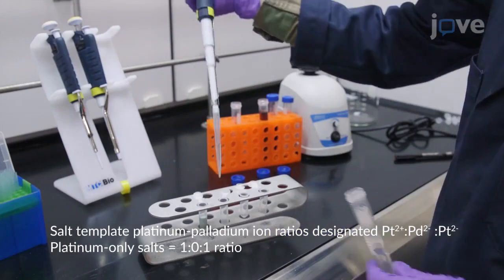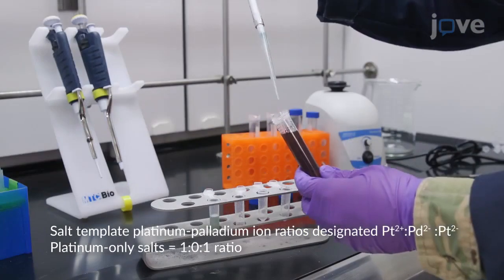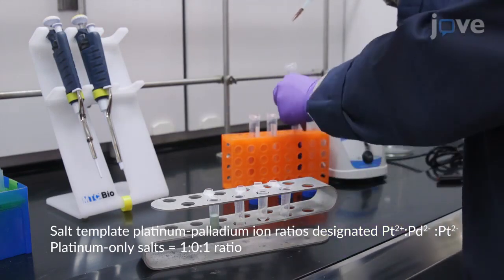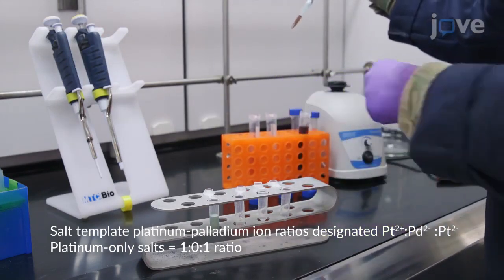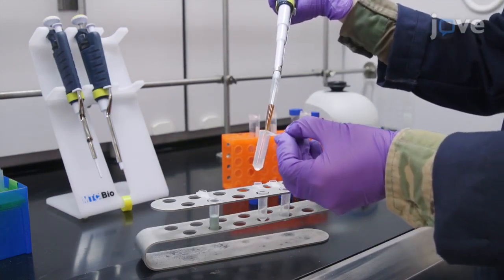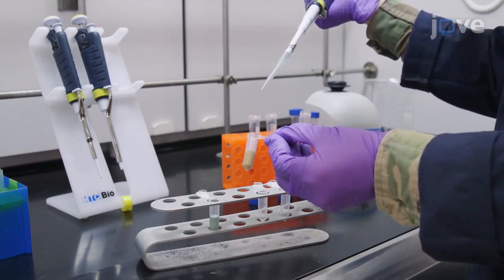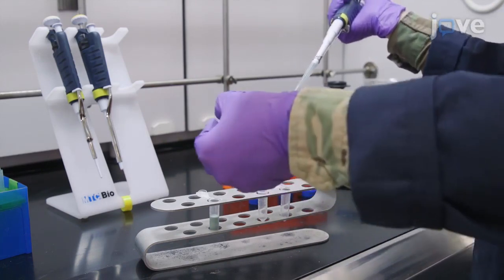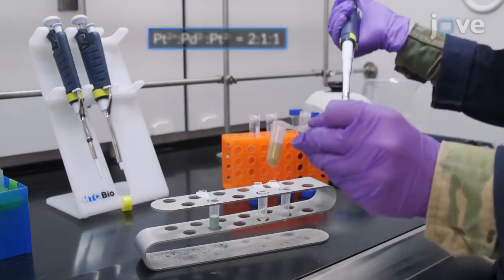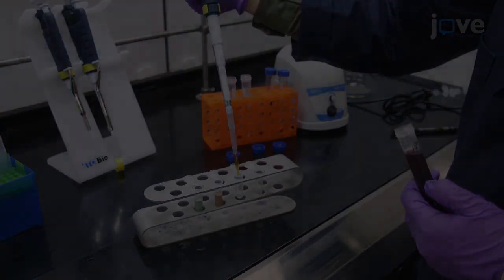To prepare a 1:1:0 platinum palladium salt needle template, add 0.5 milliliters of tetraamine platinum 2 chloride hydrate in water to a microcentrifuge tube, and forcefully pipette 0.5 milliliters of 100 millimolar sodium tetrachloropalladate to the tube. To prepare a 2:1:1 platinum palladium salt needle template, add 0.25 milliliters of 100 millimolar sodium.